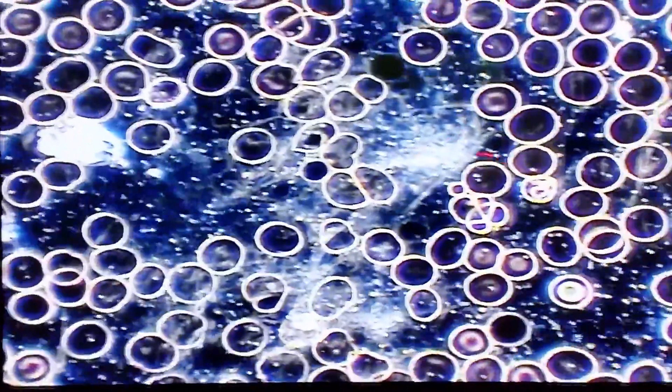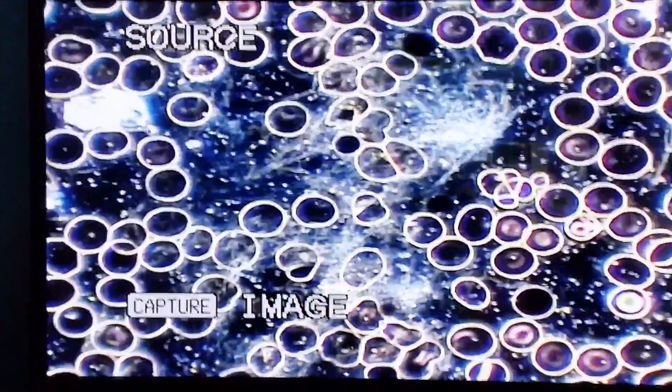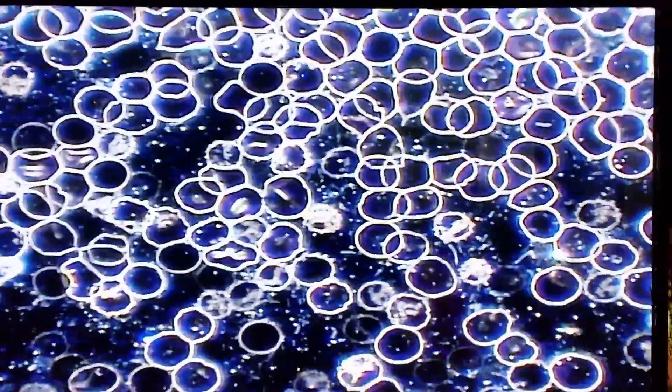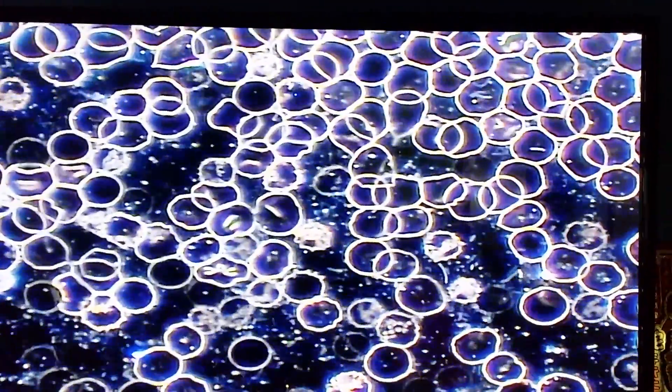That indicates toxicity. And then this one, aside from this liver stress, there's something in there. It can be a bacteria, a parasite. I don't know how a doctor can look at my history with my arthritis and everything I have going on with me and not know I have Lyme.